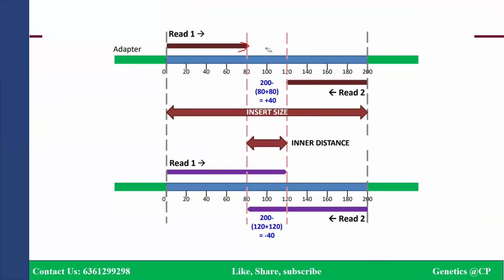Yes, sir. Sir, we should remove that overlapping, na, sir? How can we remove that? See, why are you going to remove? While aligning, it will be adjusted. After alignment, it will get adjusted. Okay?